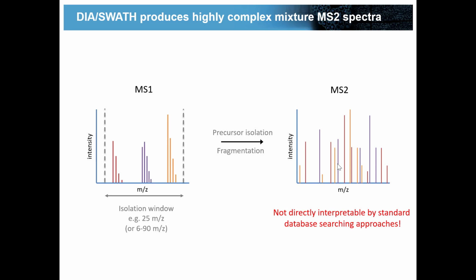Not for certain. Yeah, they're not wide enough. But yeah, that's true. So we could make them a little bit wider, but it's probably still better than not having it. If not having it at all, then there would be a bigger gap. The question is then, how important are these isotope distribution scores in the MS2, when it's combined with all the others? Now this gets into a lot of details, but we can come back to that.